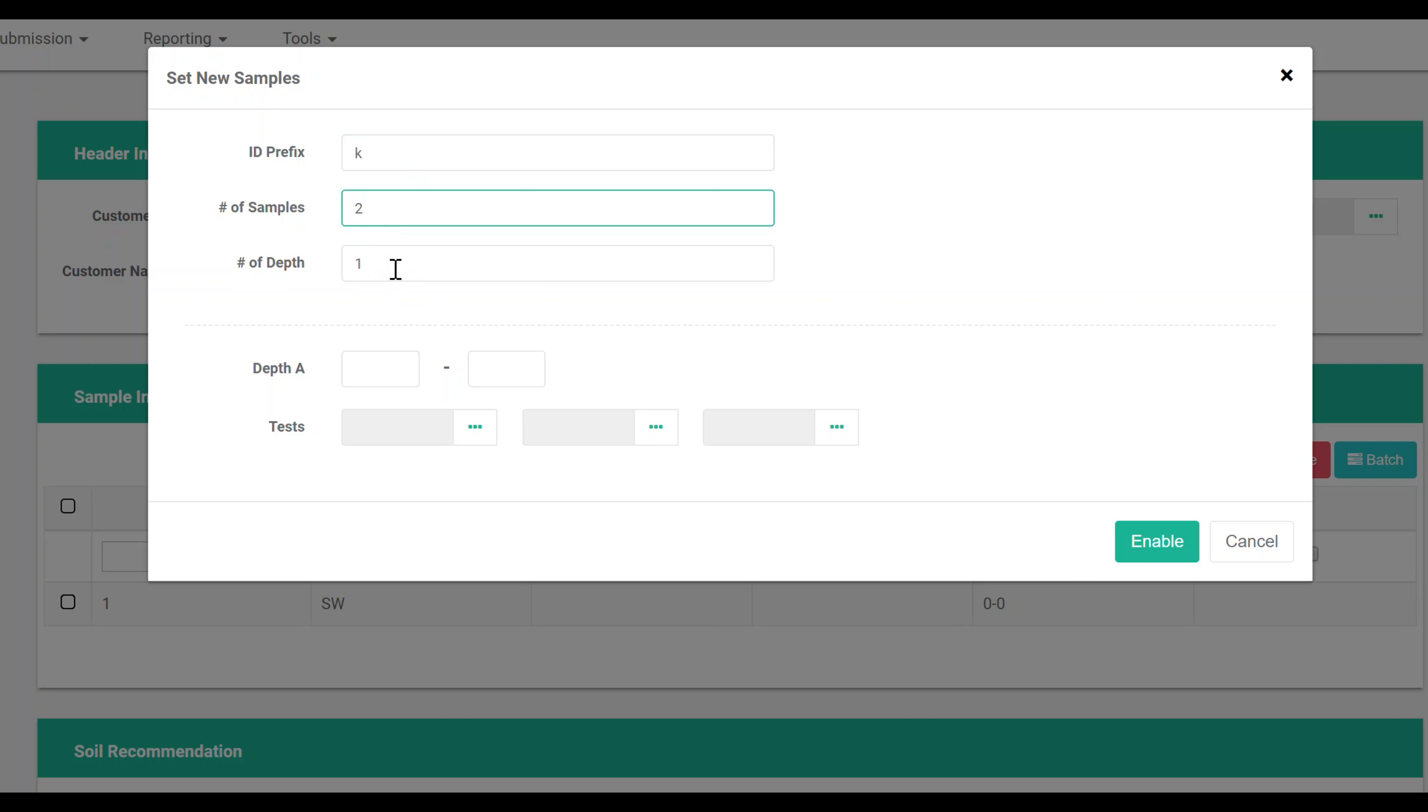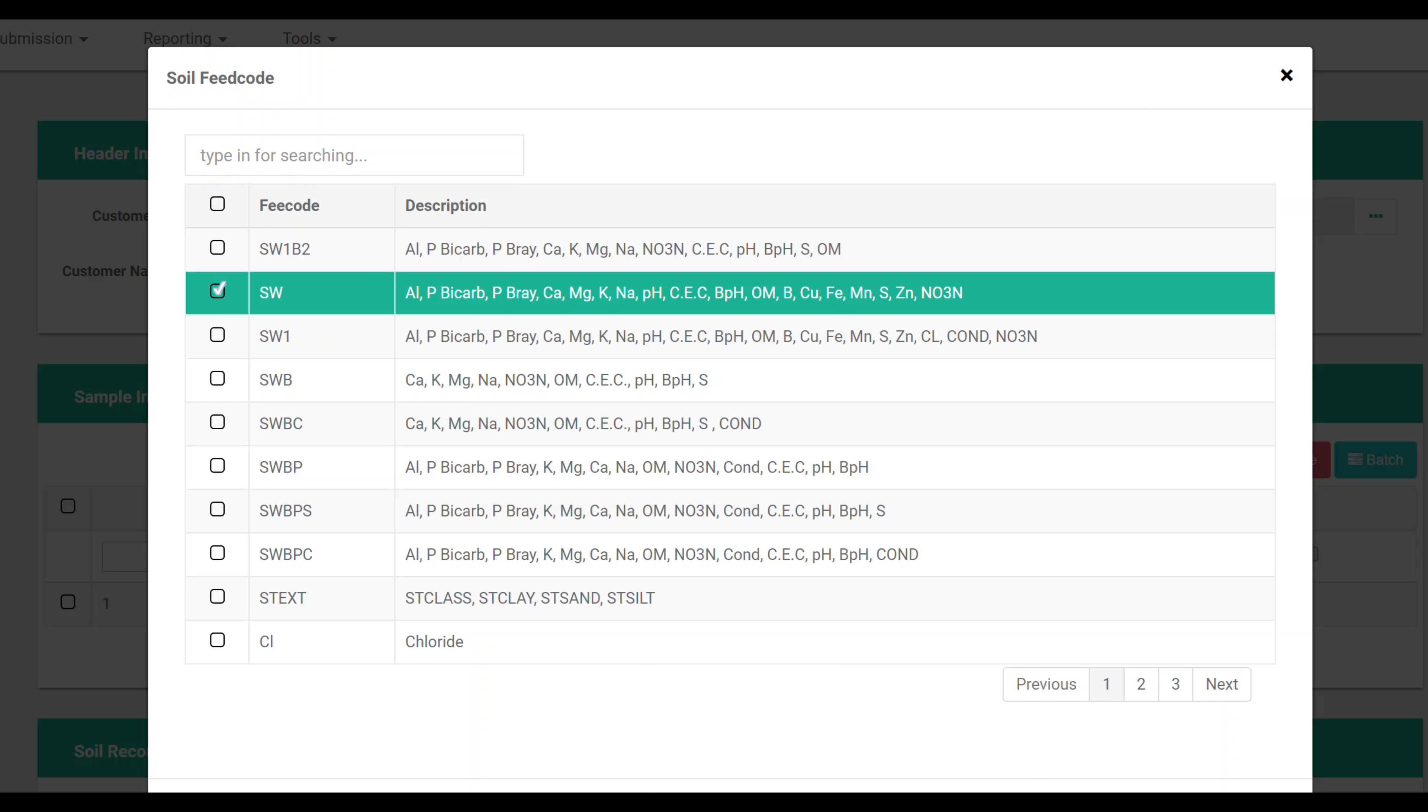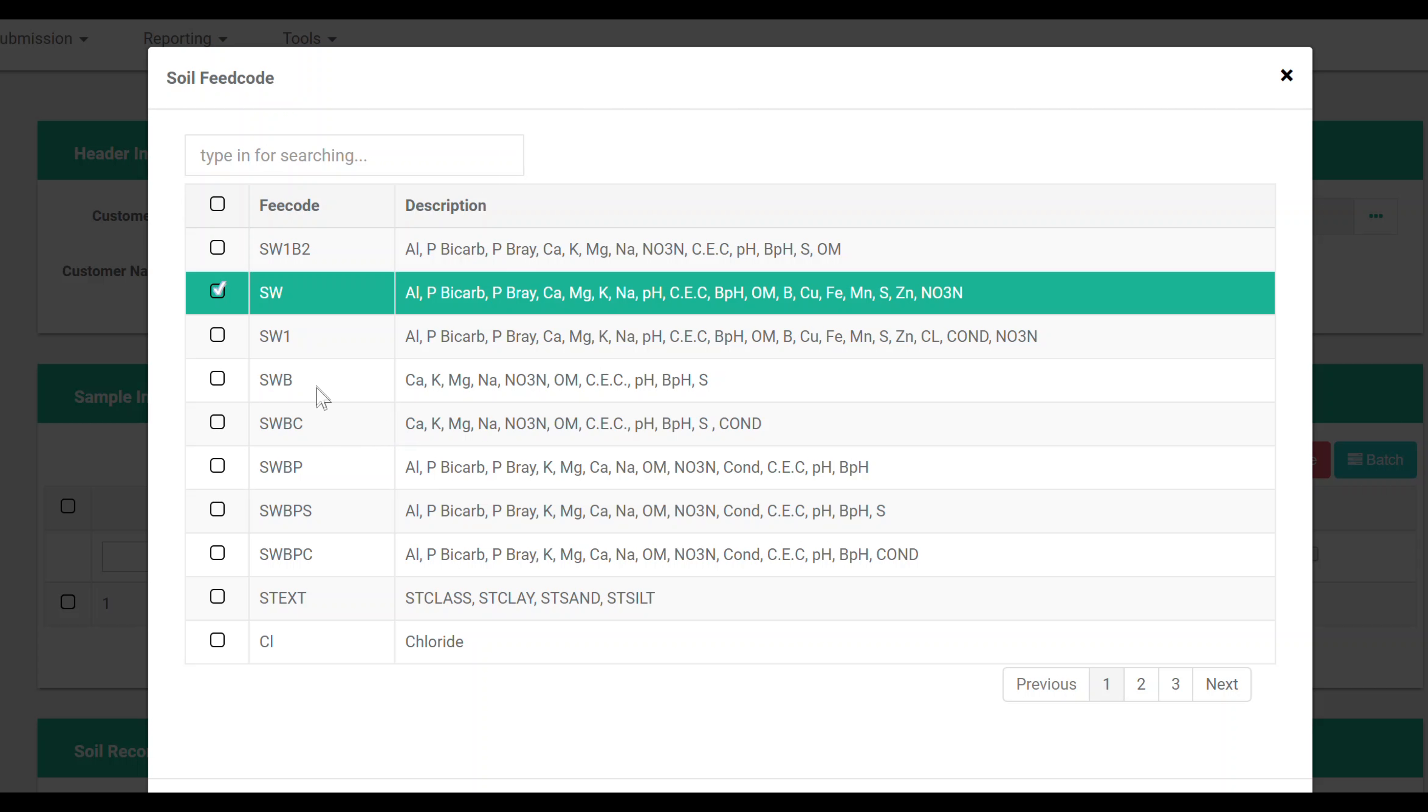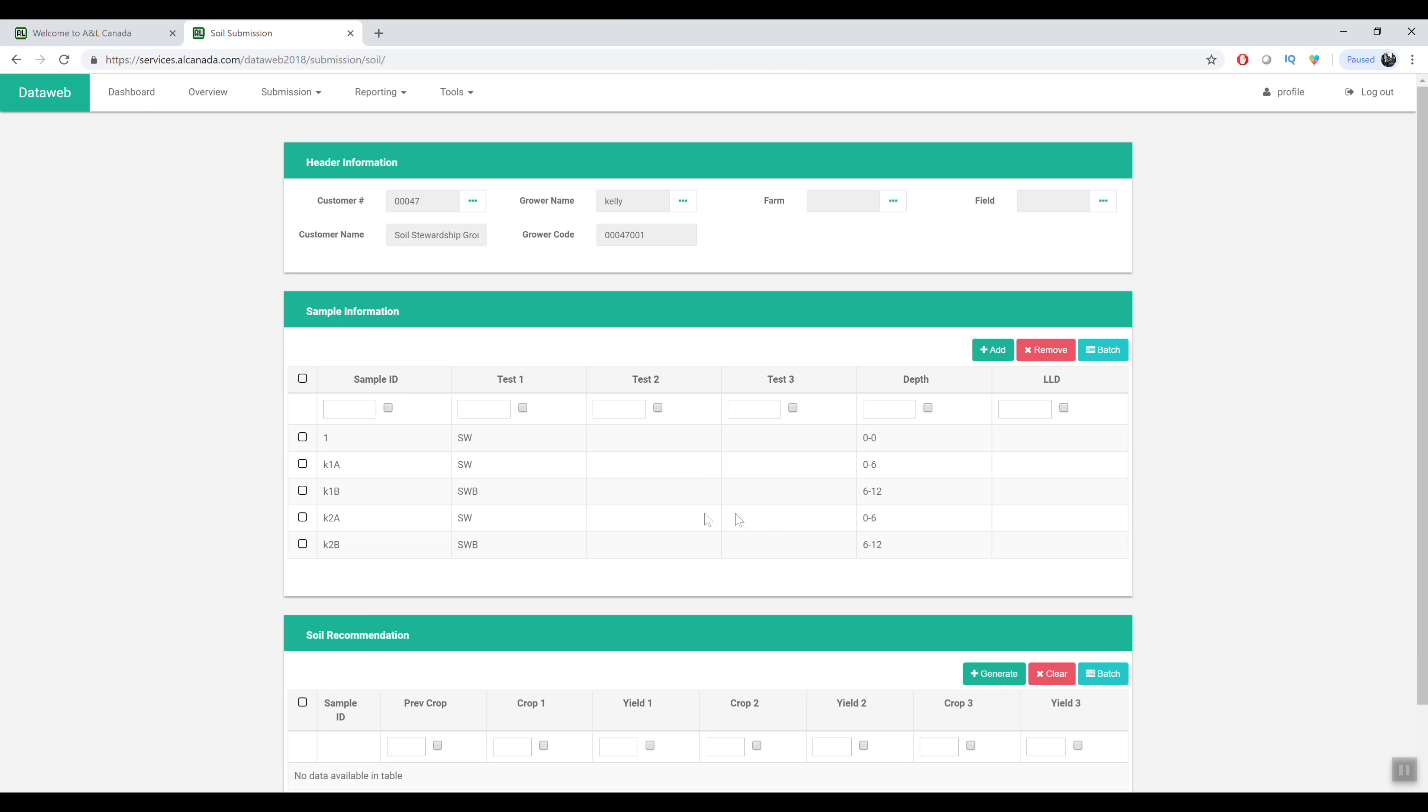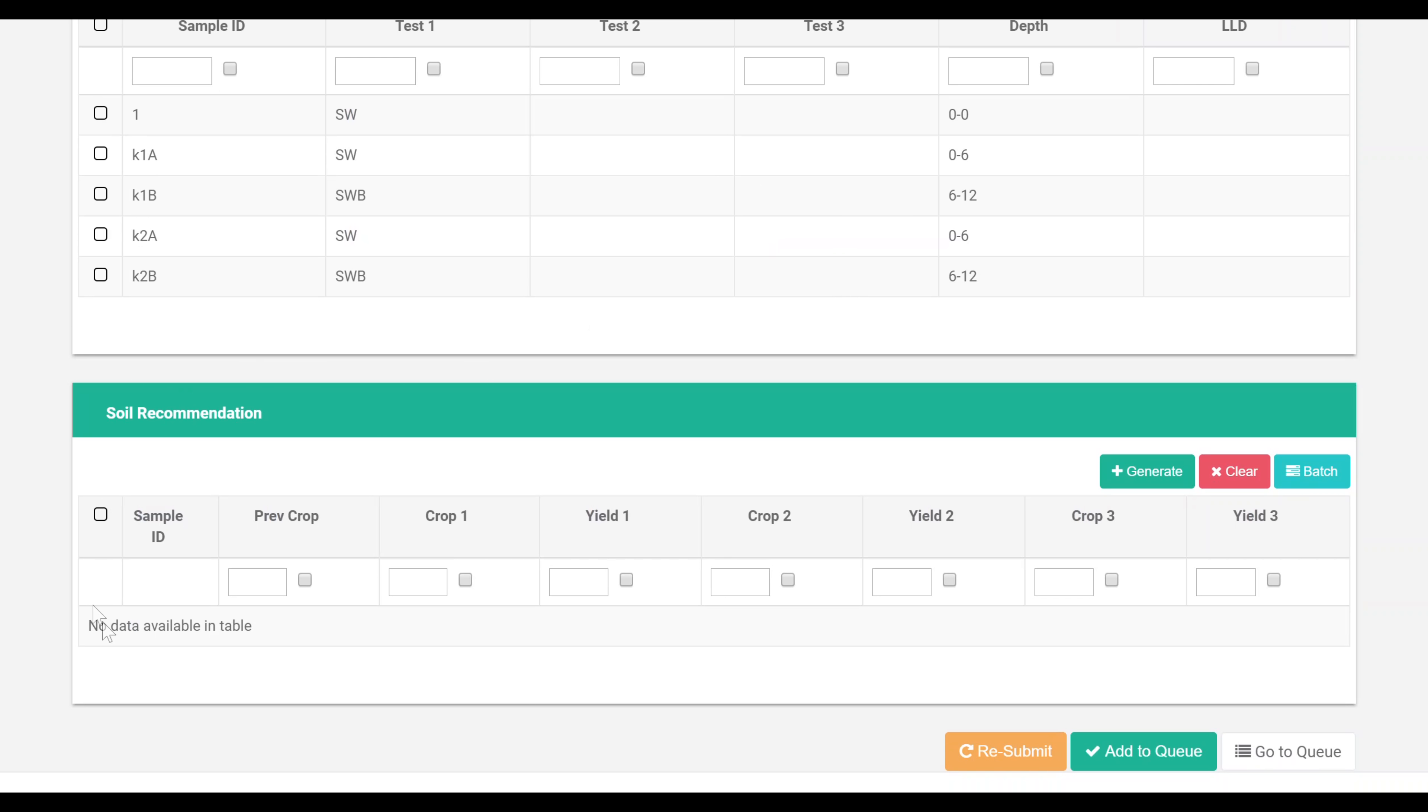We can batch create depth samples. For example if we have two samples with two depths we can create them here like so. So now we have all the samples there that I just created.